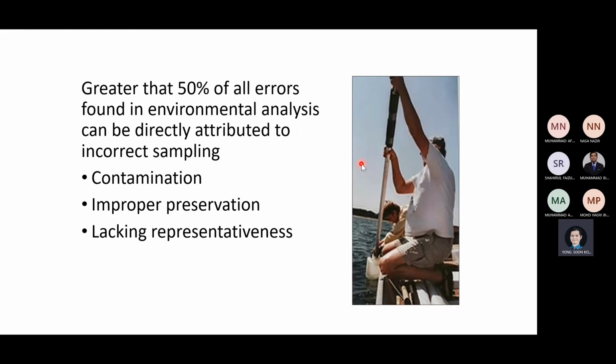Because in terms of sampling, error is around. I'd be lying if I say there is no error coming from myself. For a very experienced technician, no matter how experienced they are, when they go to the site and collect water samples, there will be some sort of error, like systematic error or random error. Random error is for sure, it's just how big.